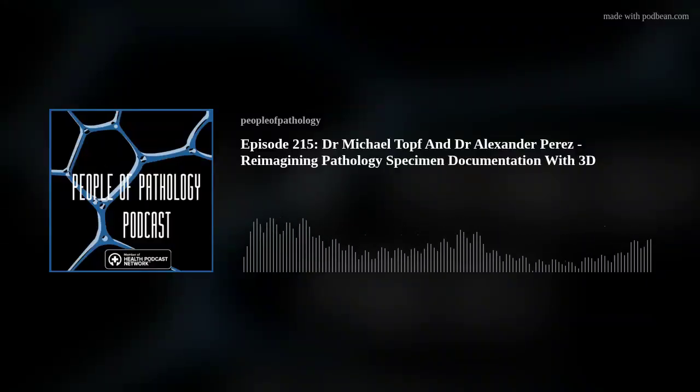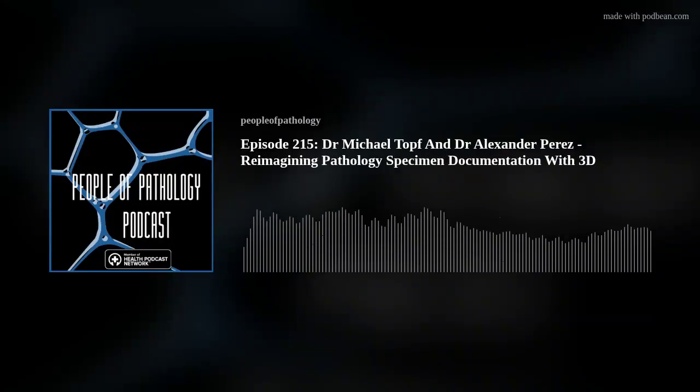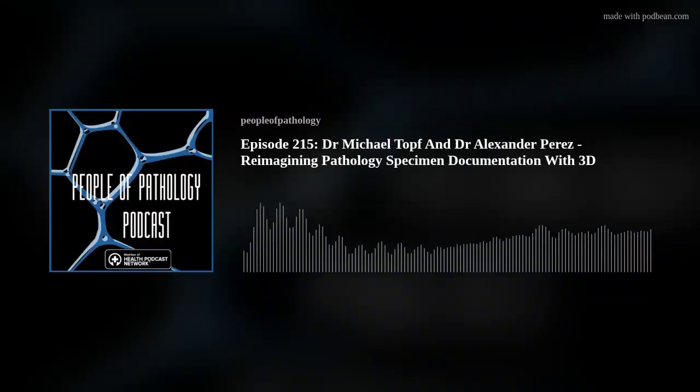But then sometimes the subtleties don't get captured, like the other side of the specimen or how things relate. I always find if I'm looking at a 2D picture when I'm looking at a case, I always just want to see right around the corner of what the other surface looked like, or what if I flipped it a little bit, what would have been photographed there. But it's just human nature. You capture the most obvious thing that you think is important, which would be the lesion. You don't always capture the side of the lesion, or what the backside of the specimen looks like.